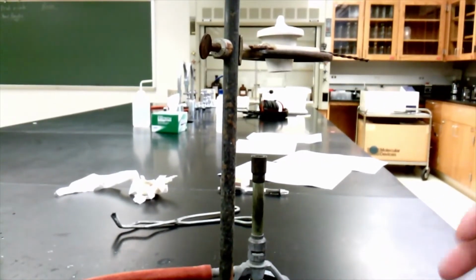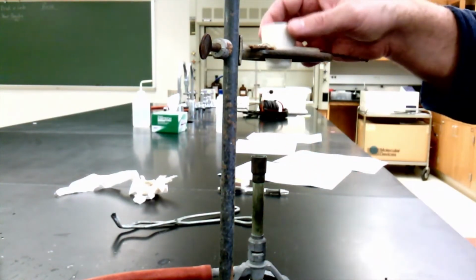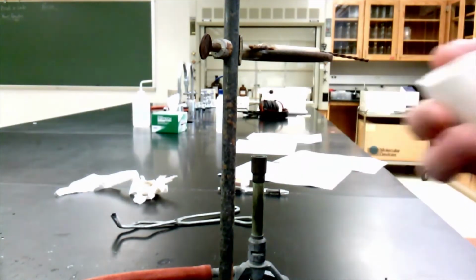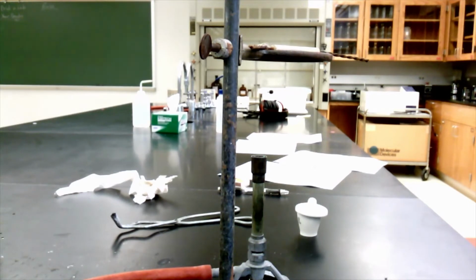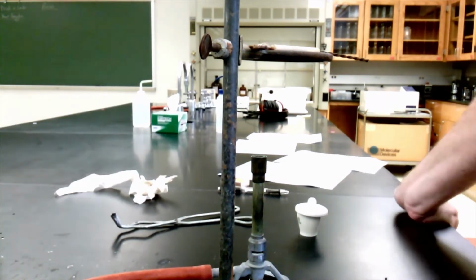I'm going to heat it like this, with the magnesium in there, until all the magnesium has reacted. And I'll know the mass of magnesium that I start with, and then I'll know the mass at the end once it's burned, and we'll talk about something odd about that in a second. And so just like the first procedure, since I know the mass of just the magnesium, I know the mass of the end product. So in procedure A, magnesium chloride, procedure B, magnesium oxide, I'll be able to calculate my mass percent of each element, and I'll be able to find my empirical formula.